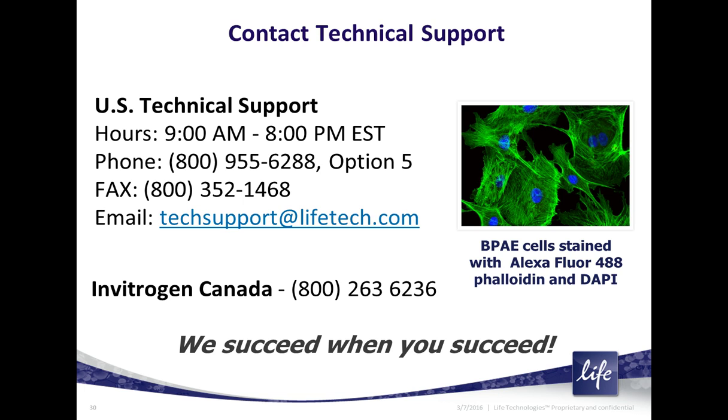Okay, are antifade agents available for live cell staining? Not really. That's something that I've struggled with here as well. Live cells are much more sensitive to different components in terms of toxicity. The antifades that you can buy commercially are for fixed cells and tissues, and those will kill your live cells.